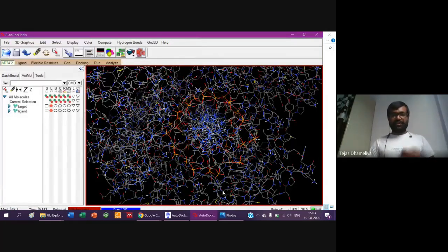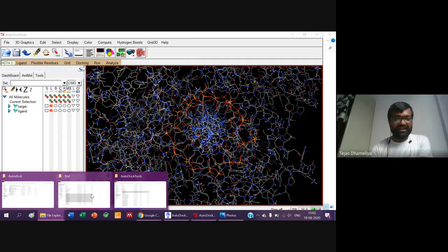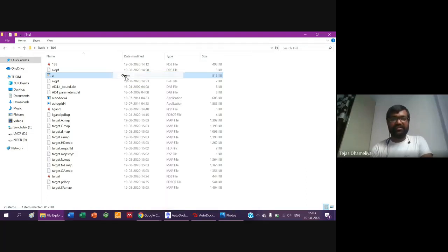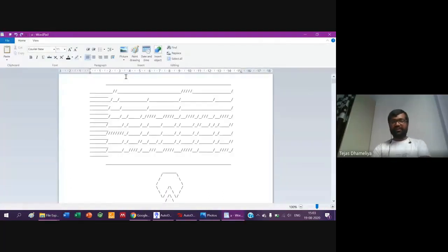Any questions? Okay, sorry, we will have questions later on because it's already done. How we can ensure it is completed is the GLG file. I can right click on it and open it in WordPad.